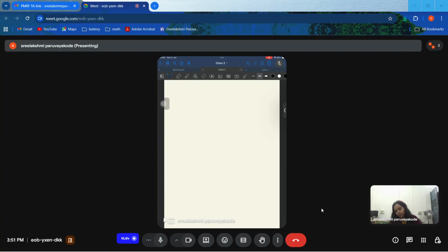Now in week 2, the next portion is the type of analyzer. And then we'll also be looking into sine and multi-sine waves. Okay. Now the experiment.